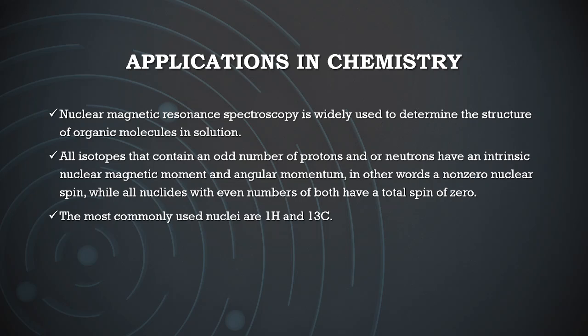The key feature of NMR is that the resonance frequency of a particular sample substance is usually directly proportional to the strength of the applied magnetic field. It is this feature that is exploited in imaging techniques. If a sample is placed in a non-uniform magnetic field, then the resonance frequencies of the sample's nuclei depend on where in the field they are located. Since the resolution of imaging techniques depends on the magnitude of the magnetic field gradient, many efforts are made to develop increased gradient field strength.